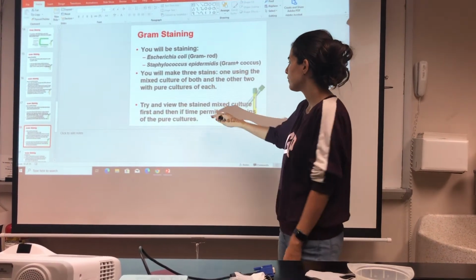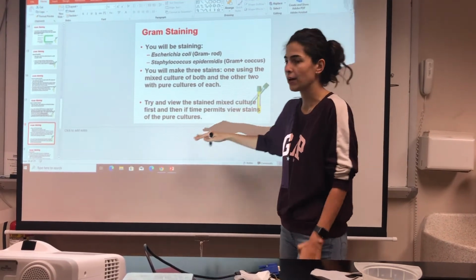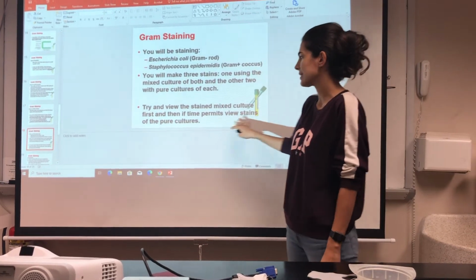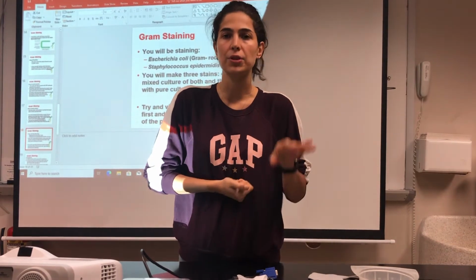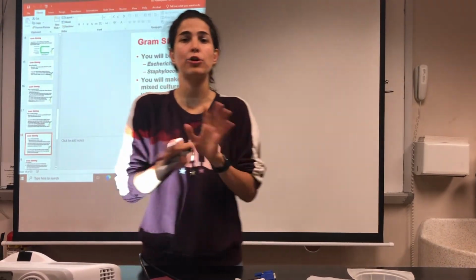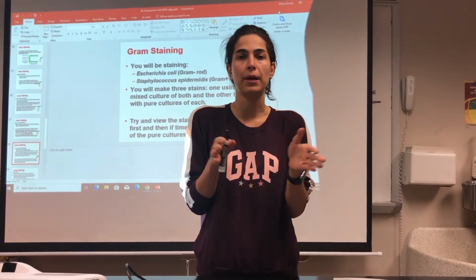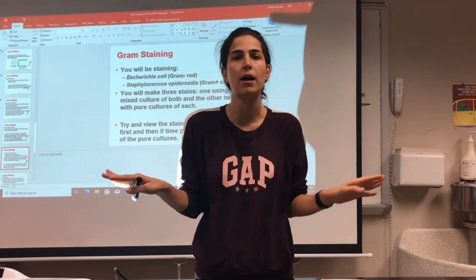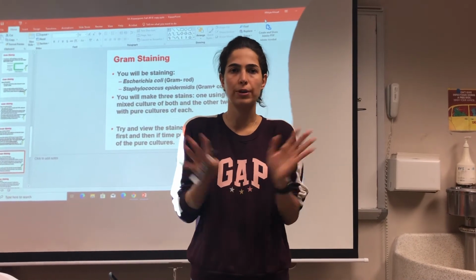We will view the stained mixed culture first under the microscope. If time permits, view stains of the pure cultures of each of them. But today we are just going to do the mixed culture. And in your lab report, you just need to write about the mixed culture, okay? Because the procedure and everything is the same. At the end, you can see both bacteria, so don't worry about anything.